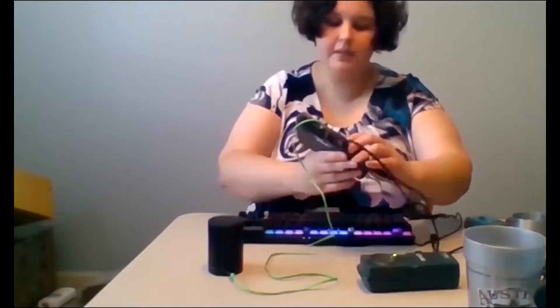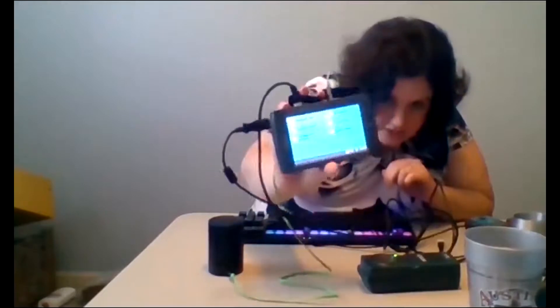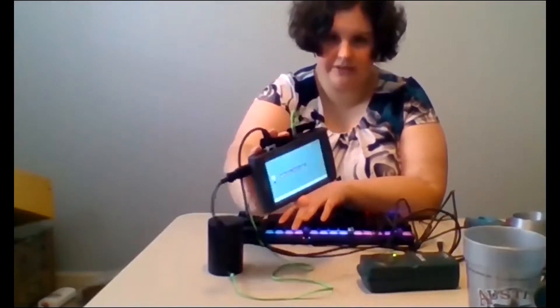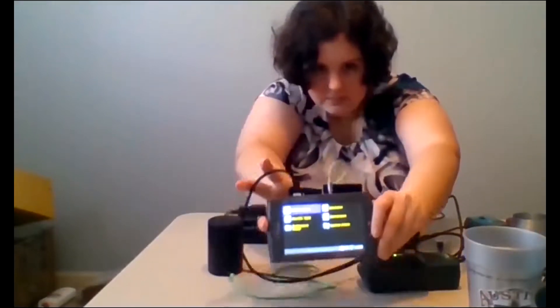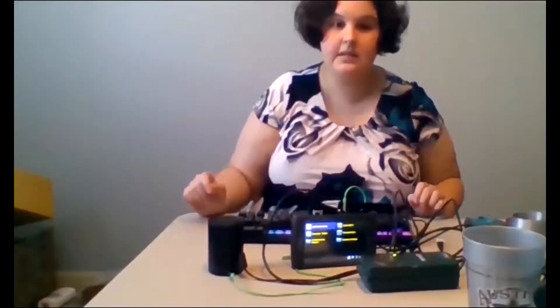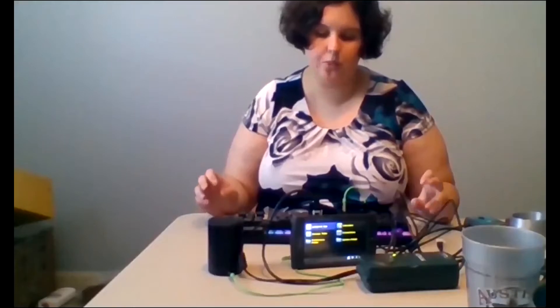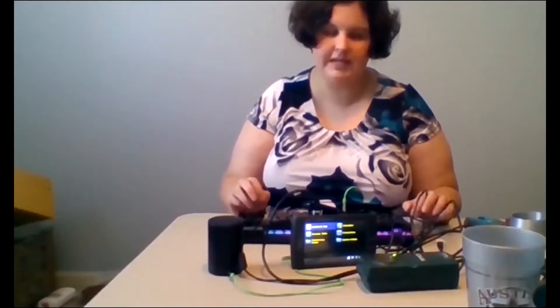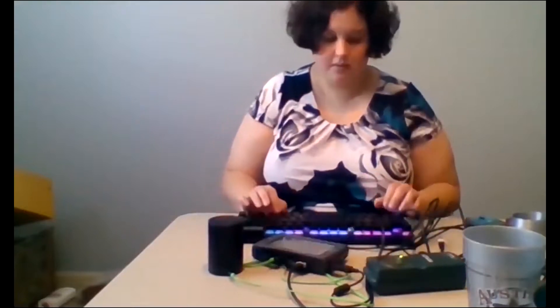When you turn it on, it will announce 'Hello and welcome to Talking LabQuest, please wait.' I'm going to turn on the high contrast mode using F11 so that it's easier for everybody to see. This gives it a black background with yellow lettering. The typical display has a white background with black lettering, and the F11 key can be used to toggle that on and off easily.